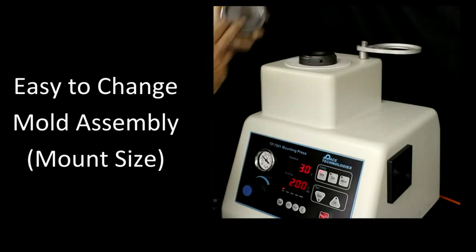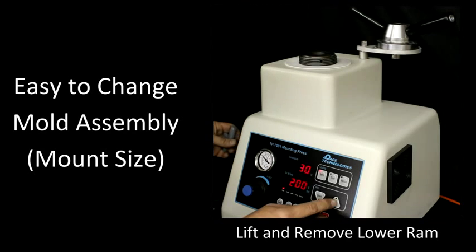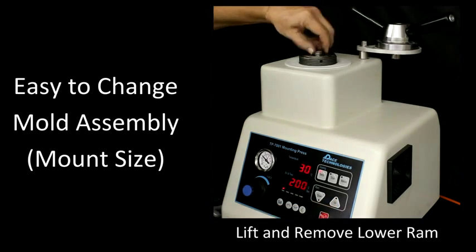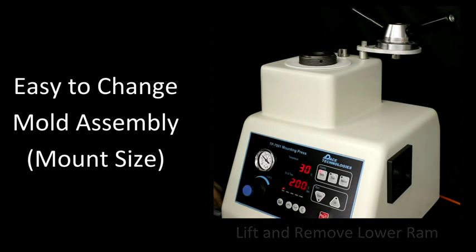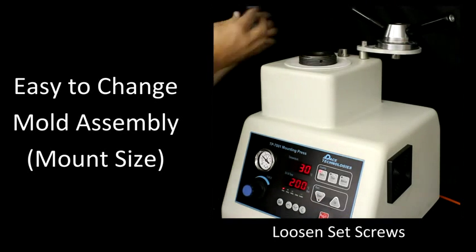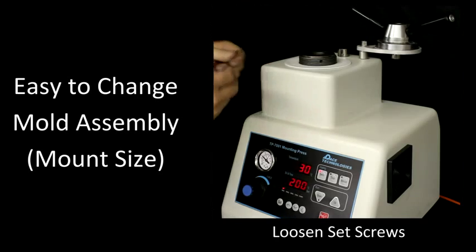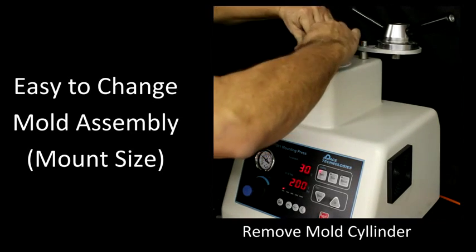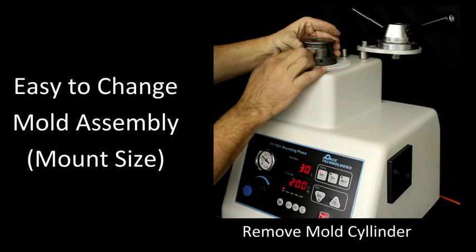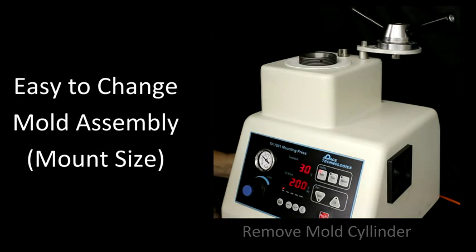Let's go ahead and remove the bayonet cover and set that to the side. The next step is to bring the ramp up and go ahead and remove the lower ram, then bring the piston back down. There are three set screws located around the mold here — let's go ahead and loosen those. Now the mold assembly should just pull right out. The set screws sit over this groove to keep the mold from being pushed out. So let's go ahead and remove that and put it to the side.